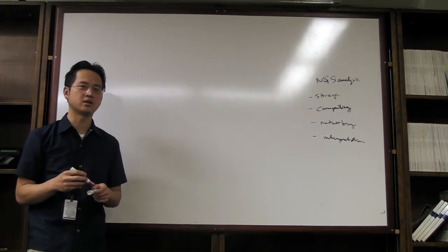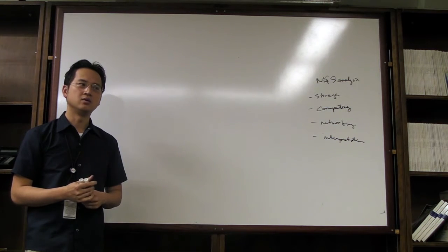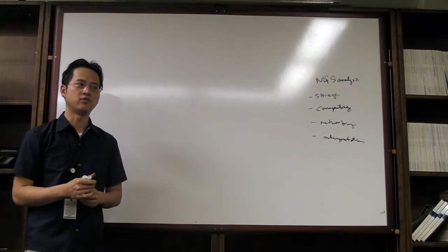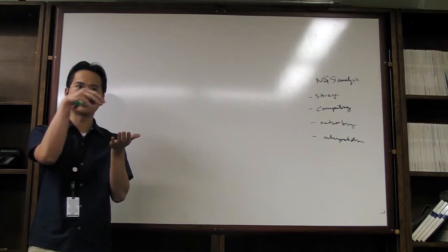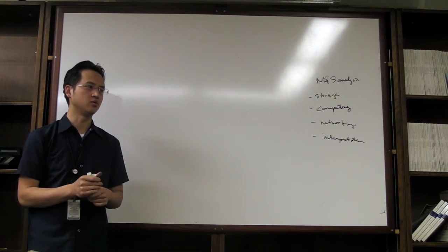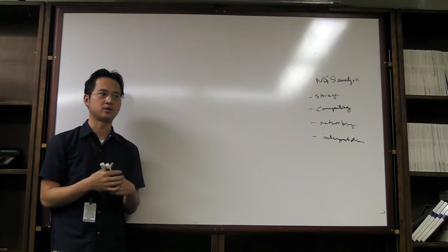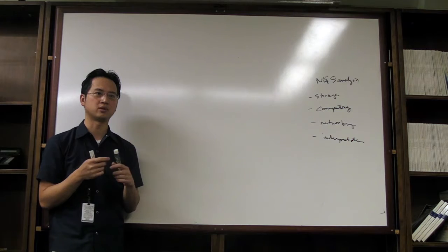I think realistically, there probably is nothing out there that can honestly do better than, say, Q40. Q40 would be SOLiD sequencing. With the two-base encoding, they have much more accuracy. I think they can reach maybe Q40. Illumina, I would say, would probably start off at Q35, Q37, Q38.